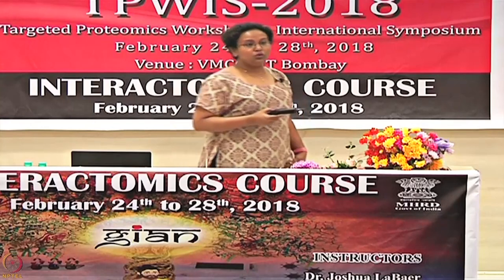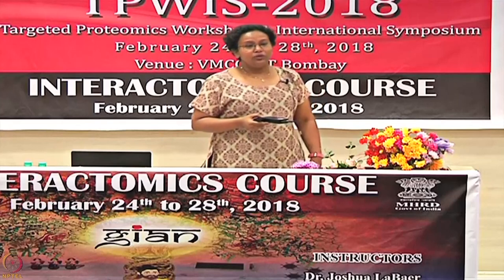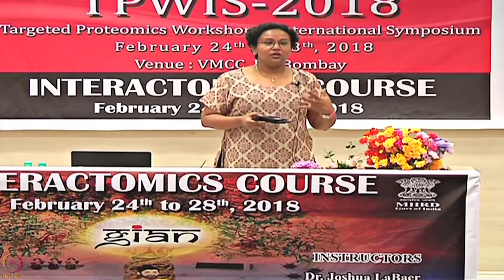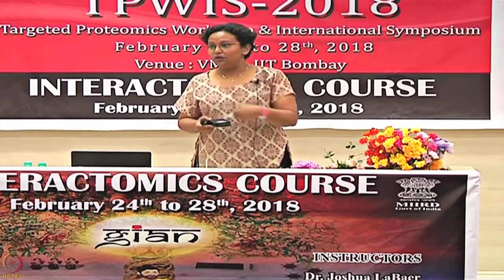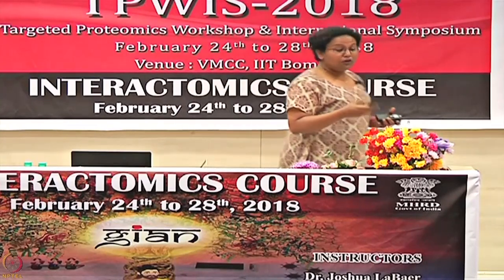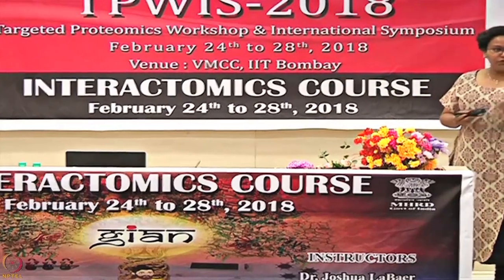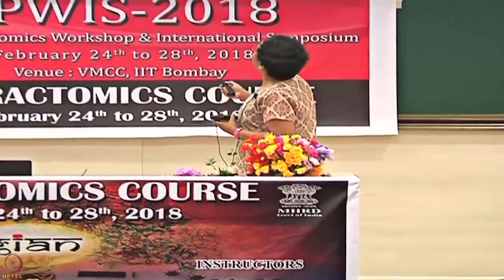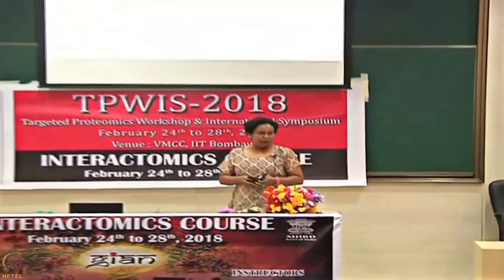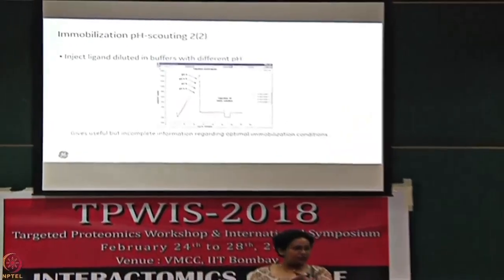So we have a tool called pH scouting, which tells you which buffer would be most convenient or ideal to use for immobilization for that particular protein. So you can take a little bit of your protein before you do your actual immobilization and run this pH scouting experiment. Take a small amount and then mix it with various buffers.